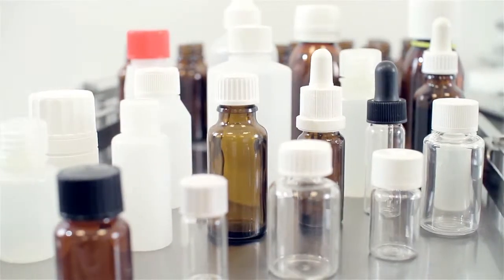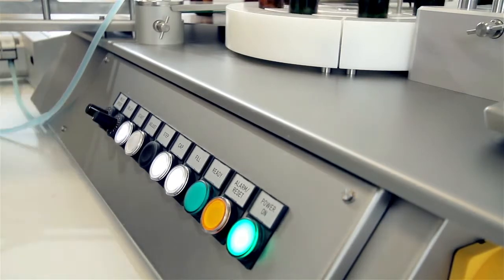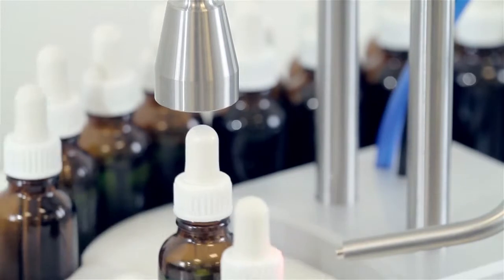It offers great flexibility in bottle and cap size and is a good alternative to costly fully automatic solutions for bottles with, for example, pipette caps or other screw caps with a special shape.